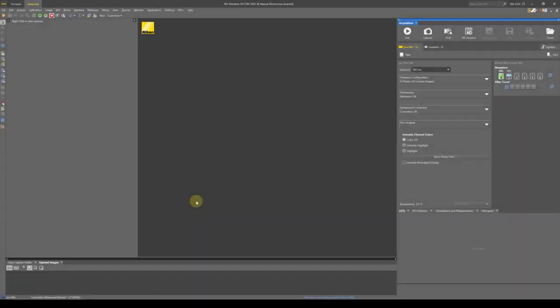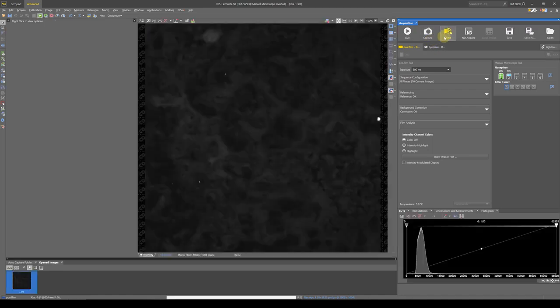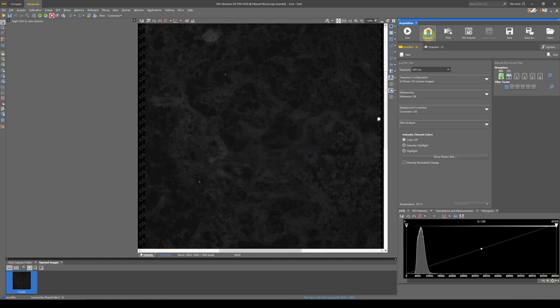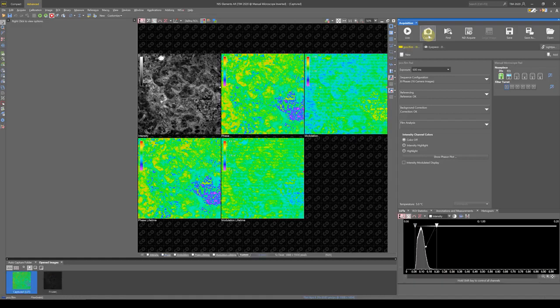Now, since I've identified a spot in the sample I would like to measure and investigate, I switch to the camera and have a look to see whether the focus is okay. I can adjust. And if I'm happy, I stop and do a capture. So this is the whole measurement.